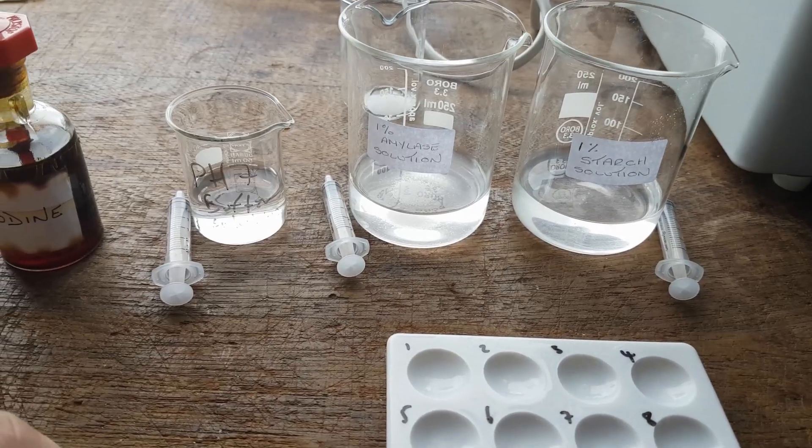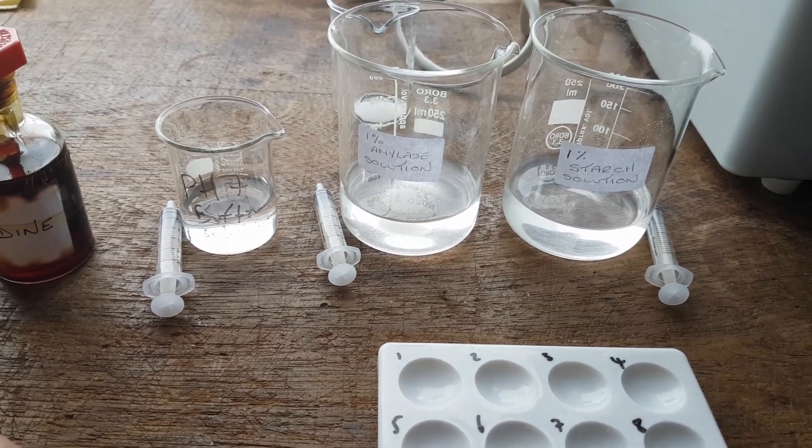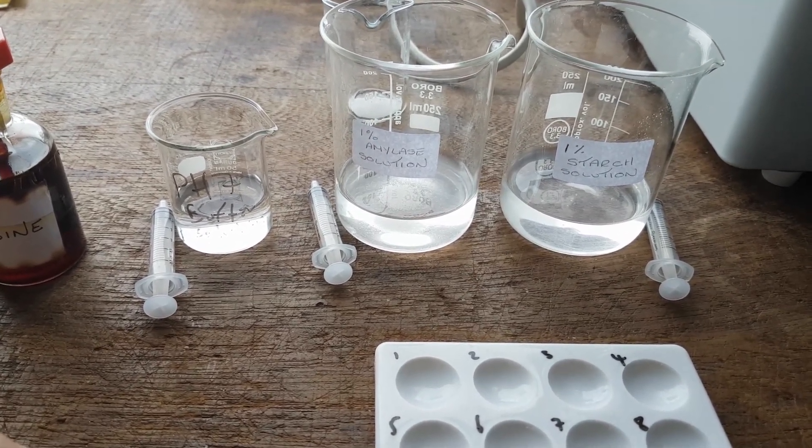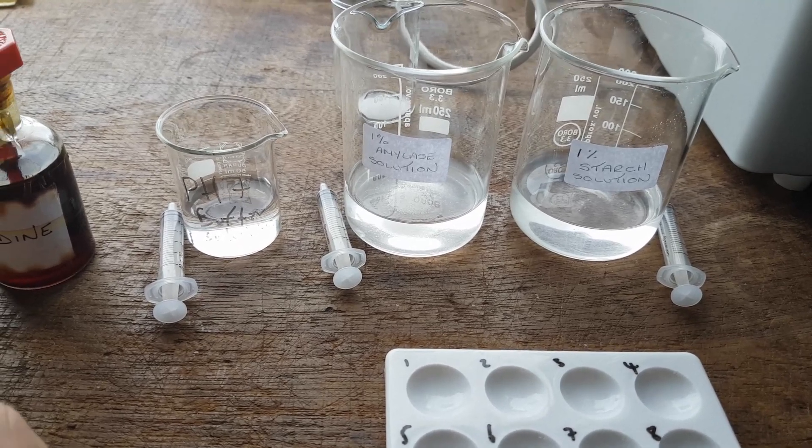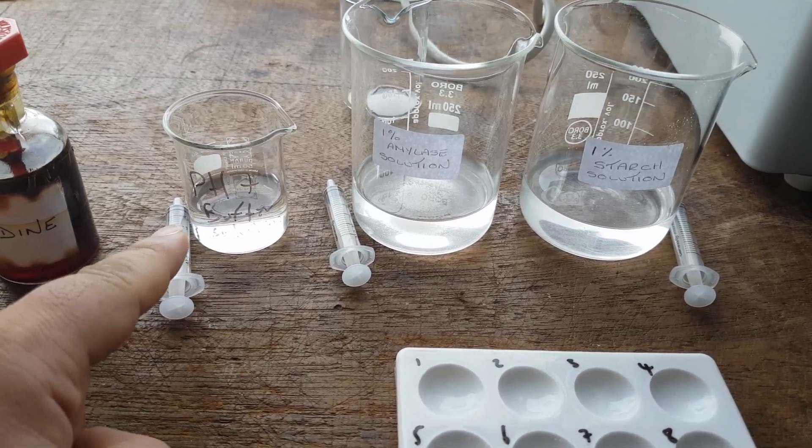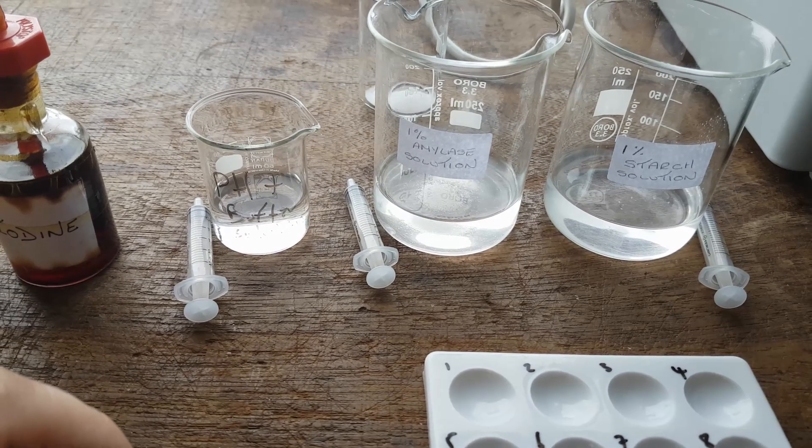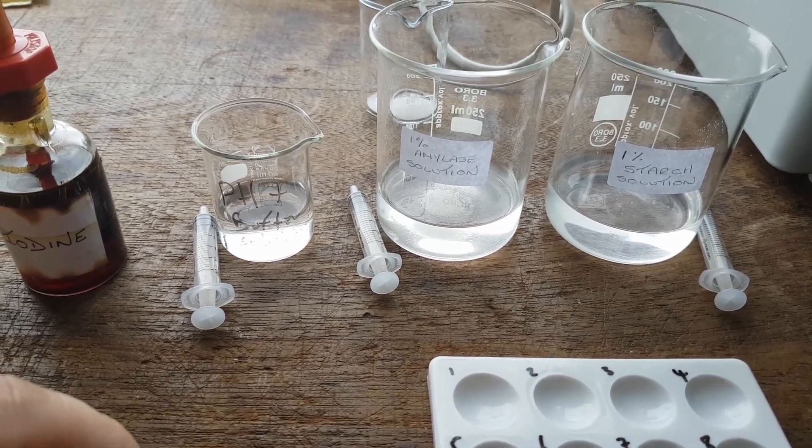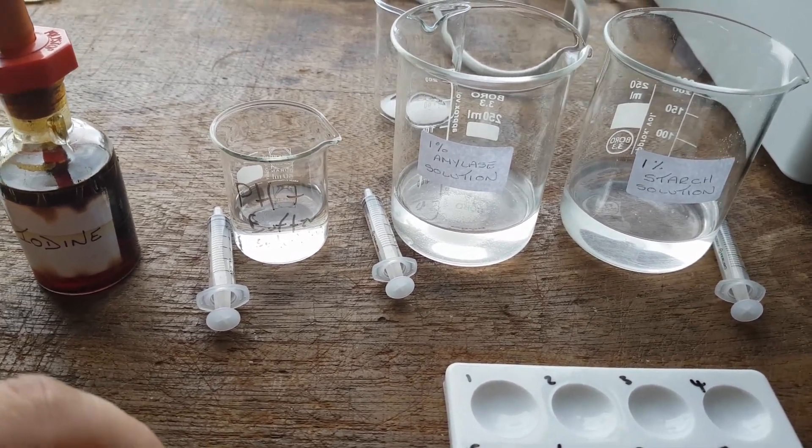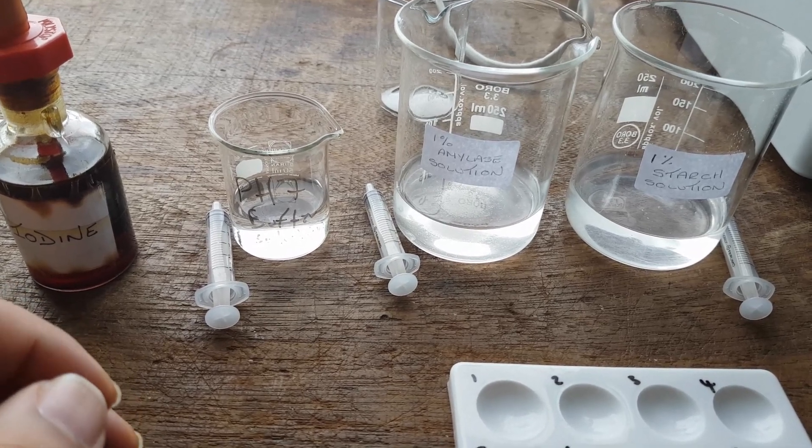Now it's important to note in an experiment, all variables must be controlled. That is to say, kept the same except one. You will be using loads of different pH solutions. So you'll be using pH 2, 3, 4, 5, 6, 7, 8. So the thing that's changing is the pH.